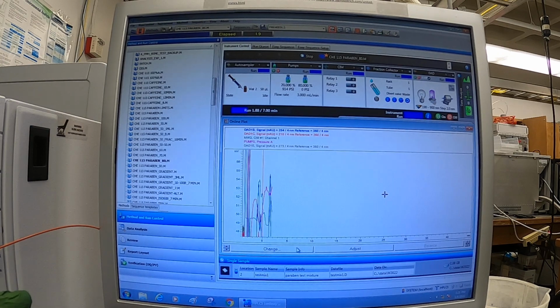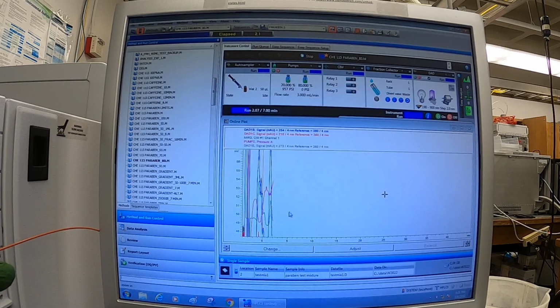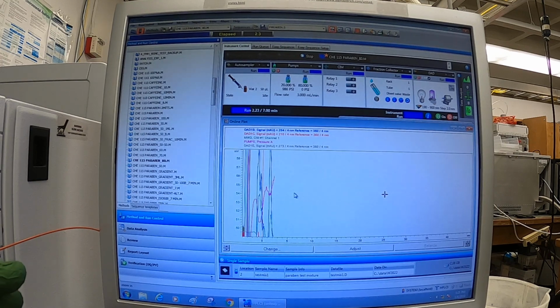Looks like we've got a pretty big change between them. 10, 0, and 1. Let's get these all on about the same line. Make that 2. Now it's a 0, 1, and 2. Now I can adjust. I can click on whichever one I want the scale to be.